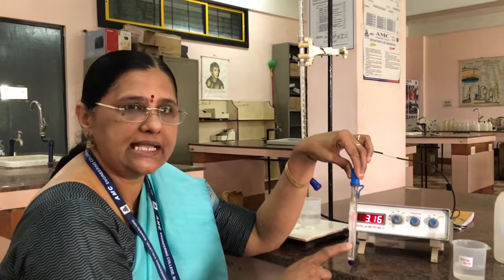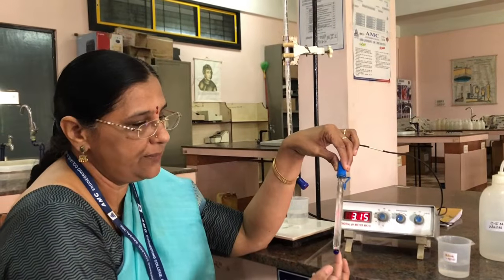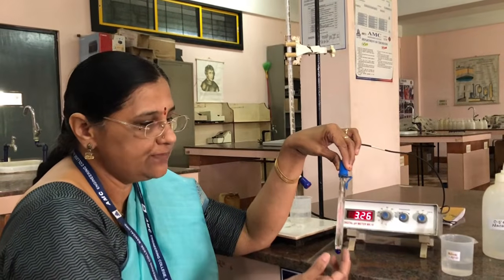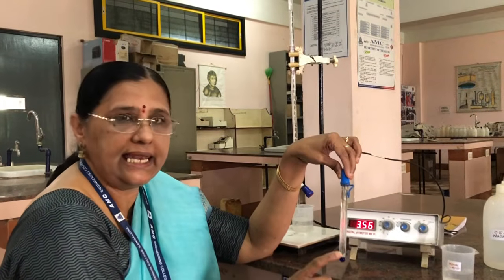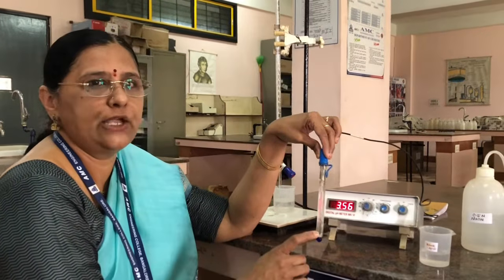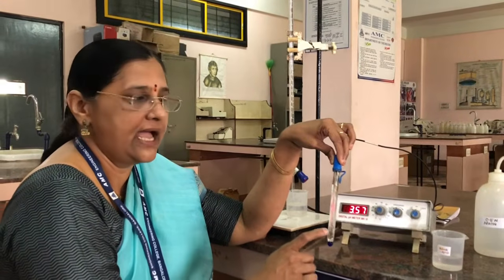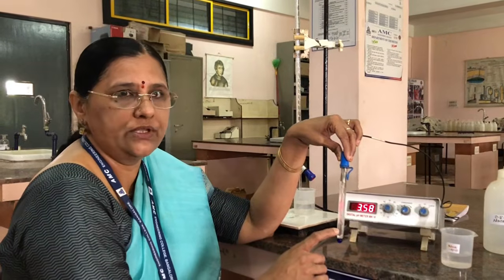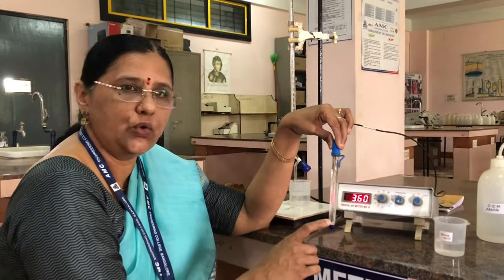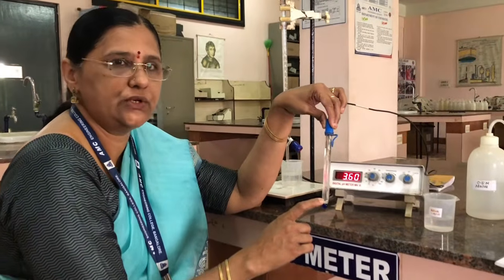Why it is called an ion selective electrode is, it is made up of a bulb, and this bulb is made up of a special type of membrane which is selective to H+ ions present in the solution. That's why it is called a hydrogen ion selective electrode. So it is selective to only certain types of ions, mainly the H+ ions present in the solution.